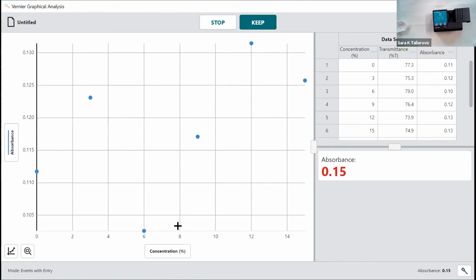But this prep is a great way to demonstrate for students that cells can be disrupted if they are placed into solutions that are osmotically imbalanced with them. Not quite as dramatic as something like putting blood cells into distilled water and watching them explode, but it is fun to be able to see the color change in the solutions and measure it with something like the colorimeter.